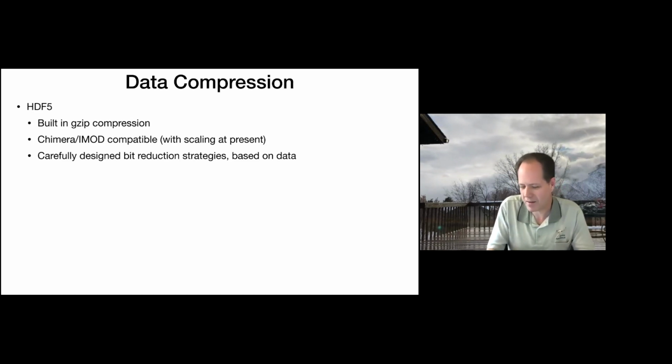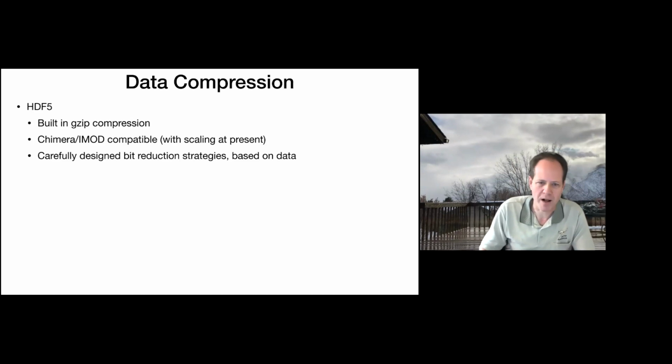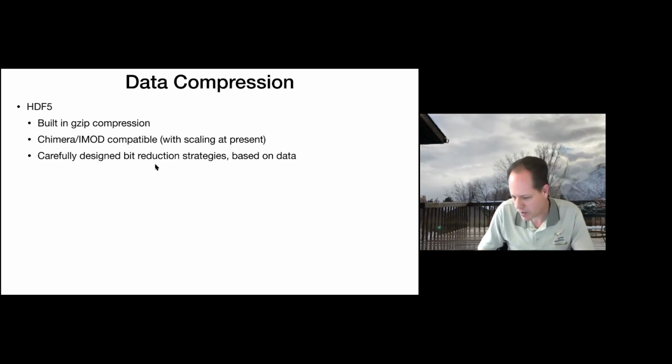Basically, we're saying that small difference in the amount of compression that you get is not worth the risk of producing data which can't be read 10 or 15 years from now because the algorithm that was used never became a wide standard or something like that. So HDF5, which is absolutely standardized, community driven by a bunch of different fields that use it, natively supports gzip compression. Gzip is also a completely patent unencumbered algorithm, which is used by everyone everywhere, and it's very fast when you don't do heavy compression, and it produces compression that's good enough.